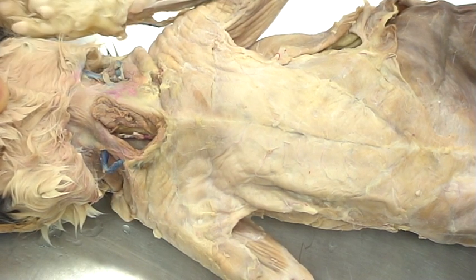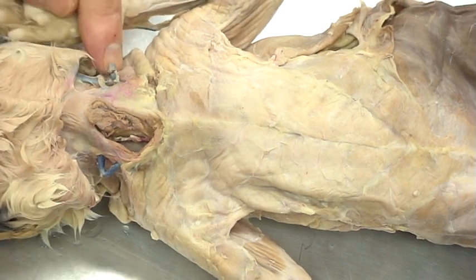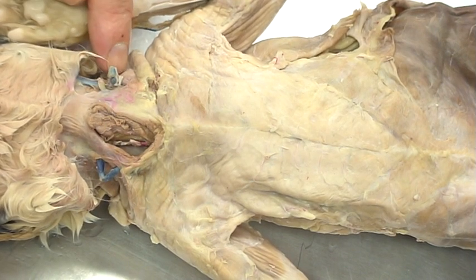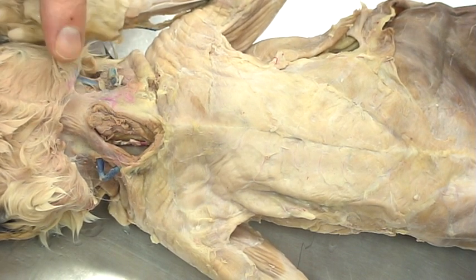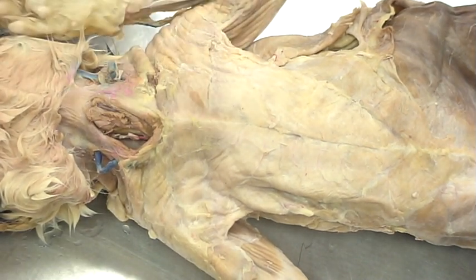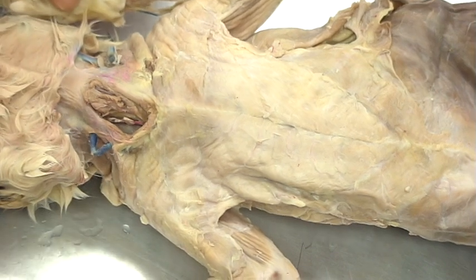I just want to point out that on the human, that is one muscle called the sternocleidomastoid. In the cat, it's actually separated into two — a separate sternomastoid and clidomastoid. I want to point that out because these are going to be prepared in different ways and it's going to be difficult to see on some cats, so I'm just going to skip it.